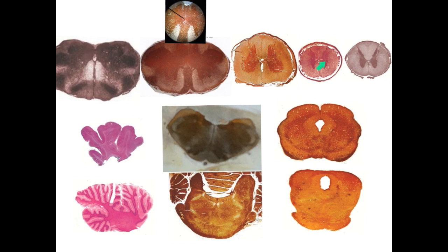If the posterior and anterior horns are almost similar, and you look at the angle between the posterior horns, they are not diverging, and the section is small in size and rounded, this is the thoracic. If the section is more or less oval, and the posterior horns are thin compared to the anterior and they are diverging, it is the spinal cord cervical. Then, if no H-shaped gray matter is present, it is a closed medulla.